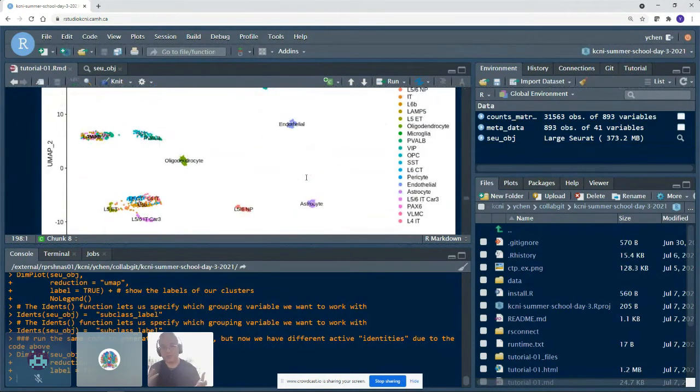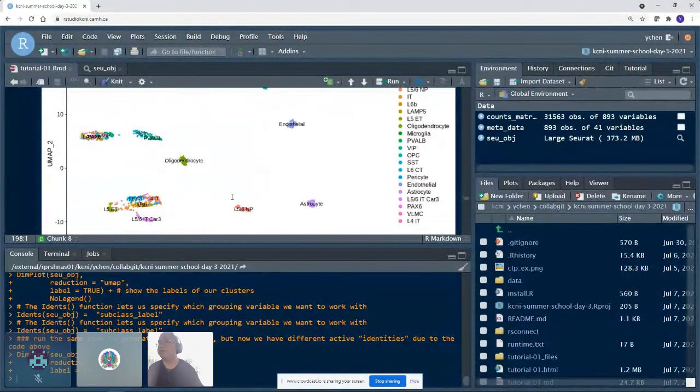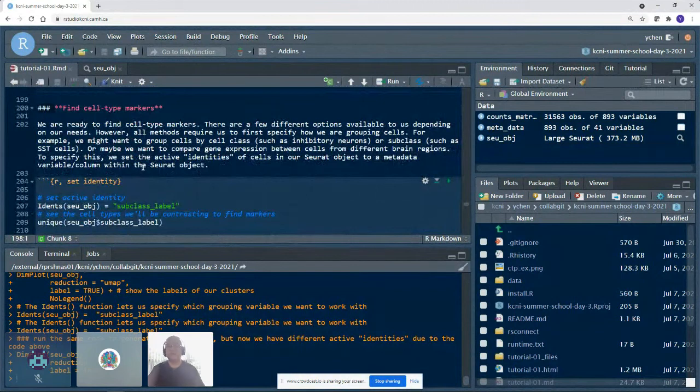So yeah, there's a lot of considerations, a lot of nuance that thankfully we don't need to go into, but all of this is just basically to say there are a lot of nuances here that could explain why our diagram is a bit different from the groups that the Allen Institute have. But for the most part, we can also be fairly reassured that most of these cells are grouped pretty well and pretty independent. So that is a simulation of what somebody might do to find groups of cells, to find clusters of cells.